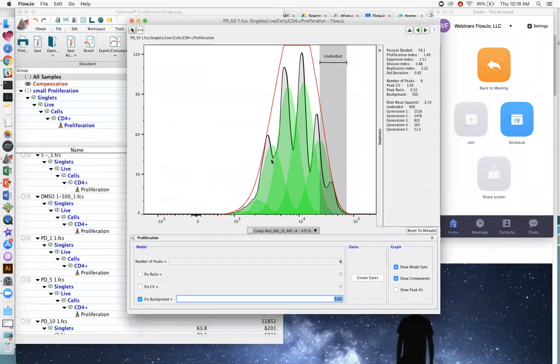Right, now, another thing you could see here is how the histograms, in my opinion, to the eye, look a little bit wide and a little bit shifted to the right. So these look a little bit fat and shifted towards the right. Now there are two other constraints here that will control those aspects. The one that I would work with first is the fixed CV. This one changes the size of the histogram's width. Currently that statistic can be found here where it says peak CV, roughly 4%.